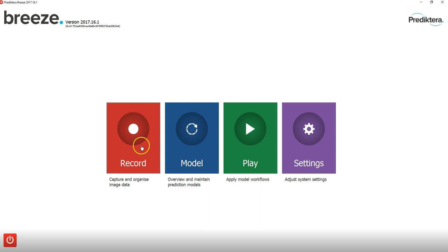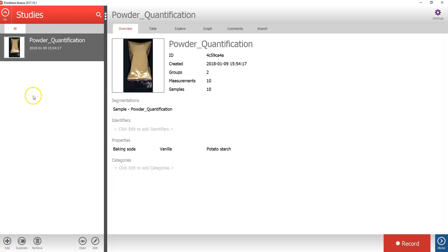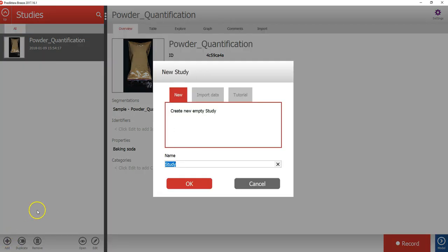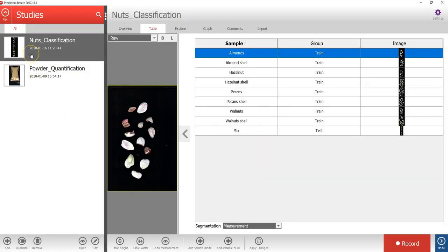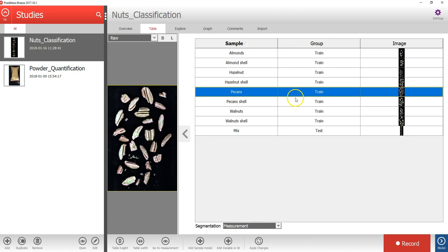Let's start by going to the record view. As you can see, we already have a study here called Powder Quantification. To add a new study, press the Add button in the lower left corner. Here you can select to add a new empty study where you could record new images from your camera, or import previously recorded image data from your hard drive, or import tutorial data from the internet. I will select to use a tutorial called Nuts Classification. A study called Nuts Classification has now been created, which includes eight different hyperspectral images with either nuts or shell.